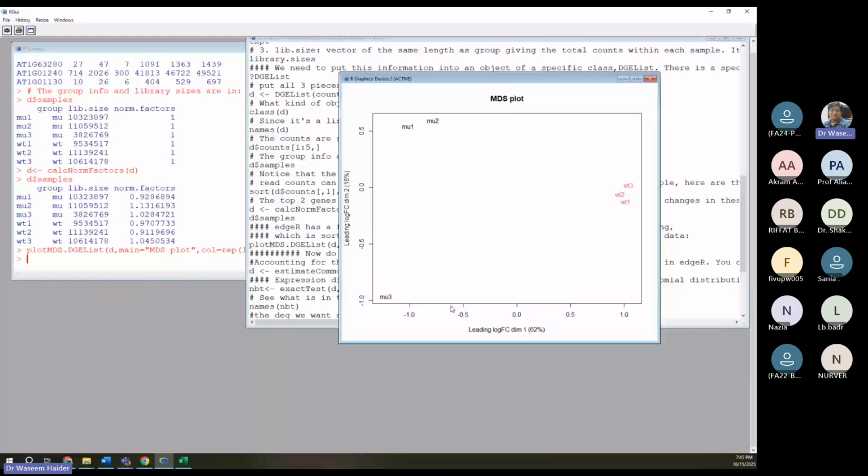How to interpret this graph? If you are familiar with principal component plots, this is similar. From here, we are also entering into the next domain, the AI thing. That's unsupervised machine learning. So we applied this function. Pictures like PCA or the multidimensional scaling plot, or I think in the next we have t-SNE plots, all those things are where we are doing this unsupervised machine learning.